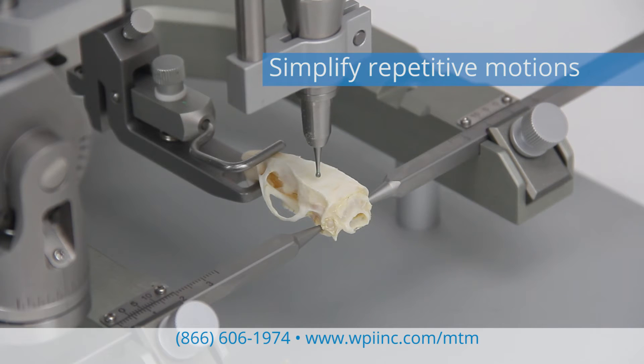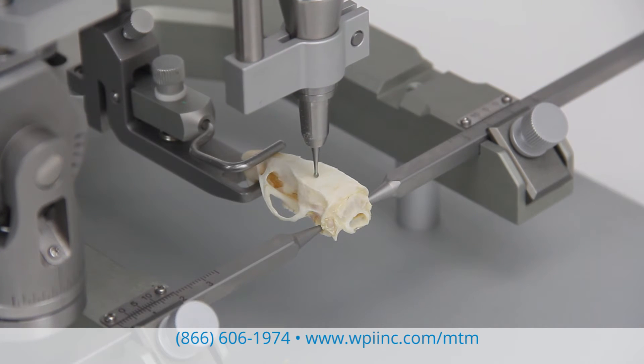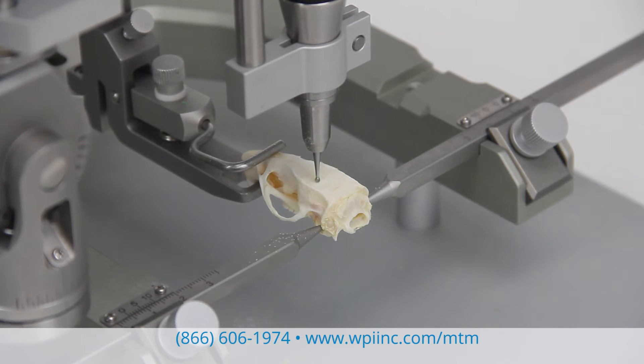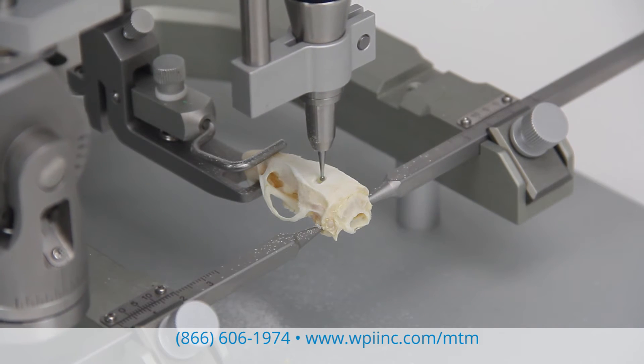Repetitive procedures like drilling operations, injecting into multiple holes, and movement between coordinates can all be simplified. Once you set up your programs, you get consistent results every time.